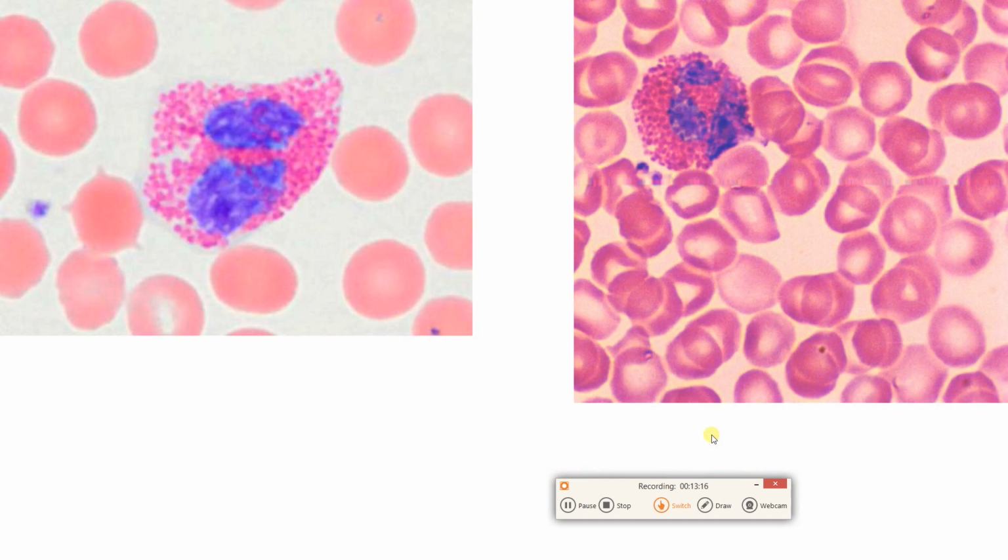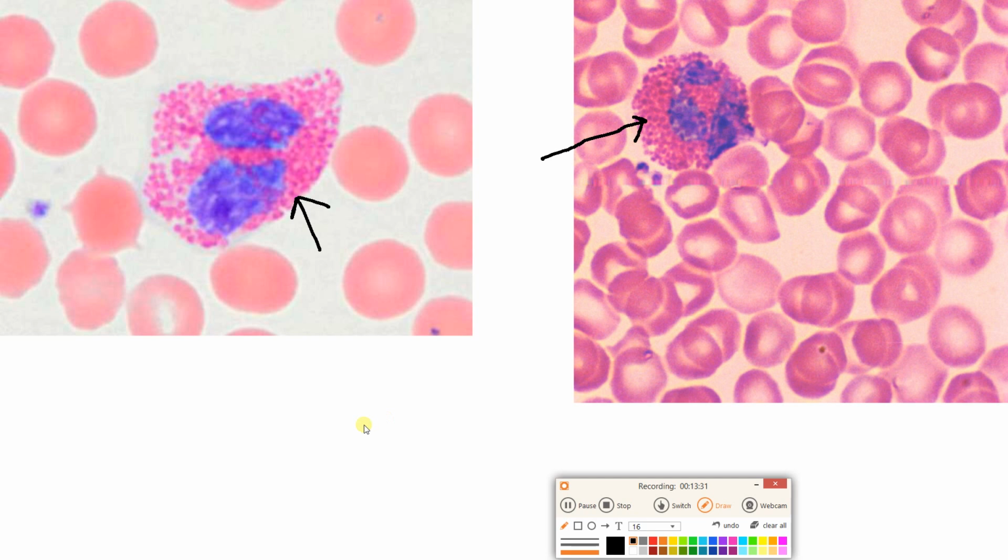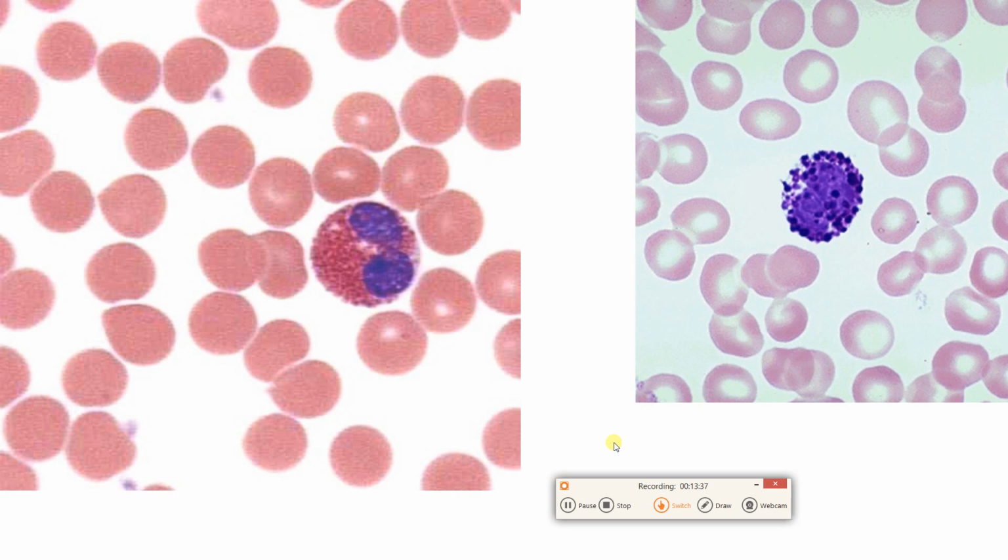I got even more white blood cells. Who are these two guys right here? Again, I'll give you a second. Get your idea. This and this, they are both eosinophils. Fantastic. I got two here, this guy and this guy. Easy, look at that color. This is another eosinophil.